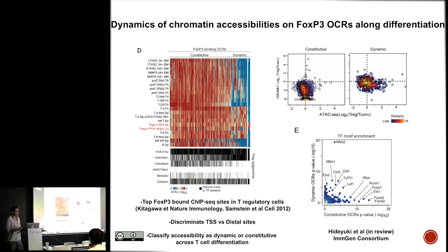So this is the ability to take a rich resource like this, ATAC-seq data that's very comprehensive, but then to ask very targeted questions about data that's only captured at one time point in the differentiation. There's something about how do you distinguish between dynamic regions versus heterogeneity in the population you're looking at? So dynamic between this series? Yeah.